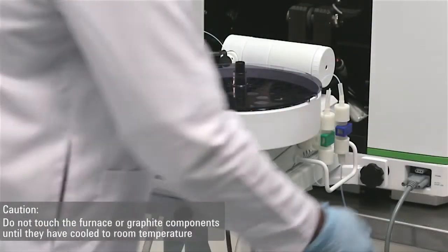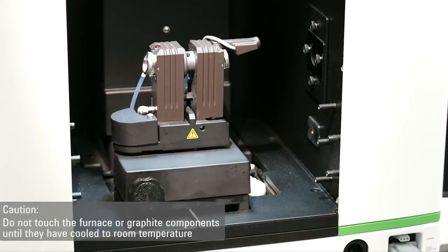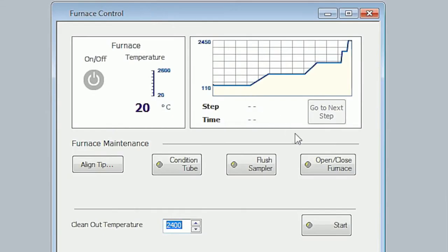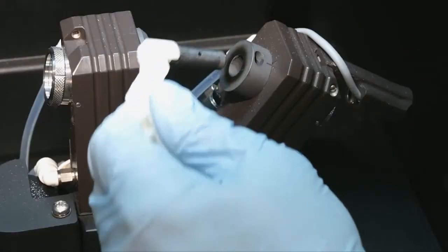Release the auto sampler by undoing the left and right knobs and swing the auto sampler away. To remove the graphite tube, click the open/close button in the furnace control window of the software. Remove the graphite tube.